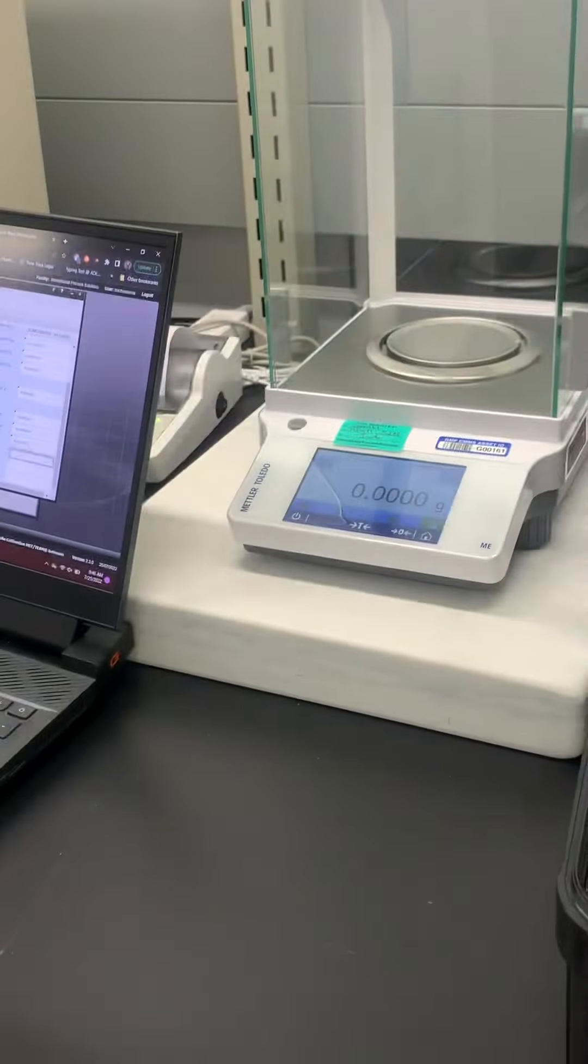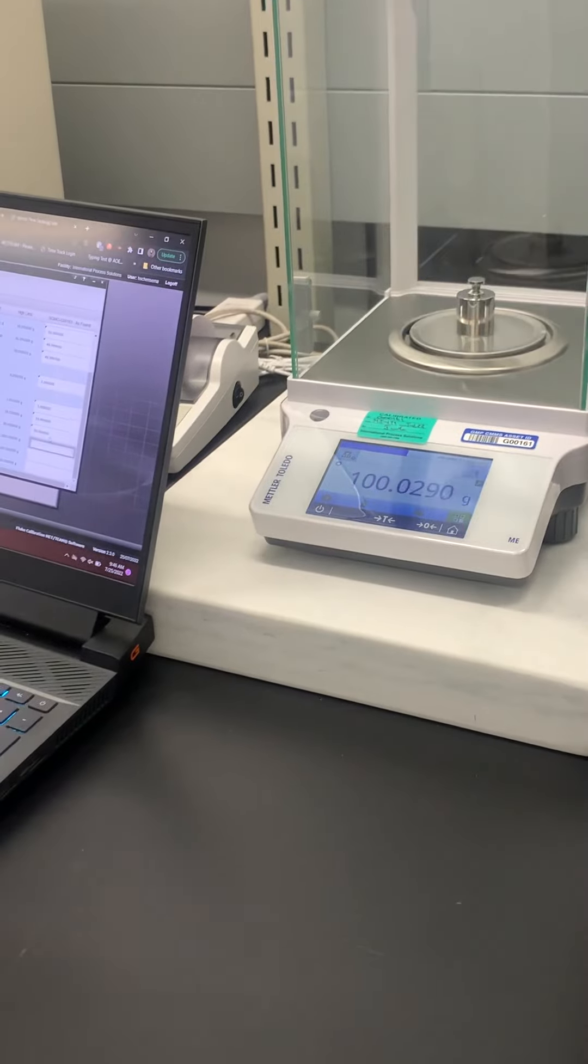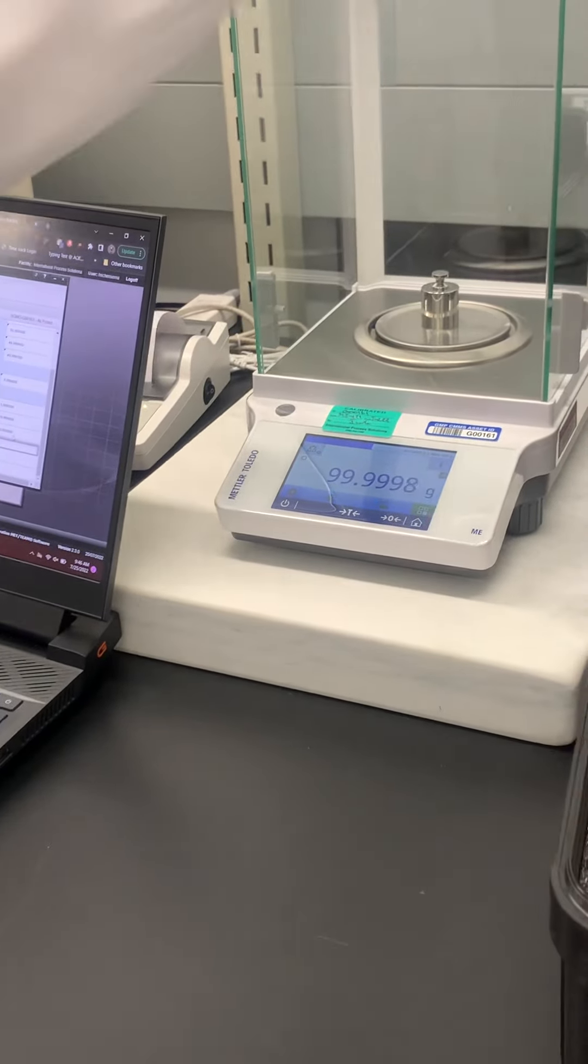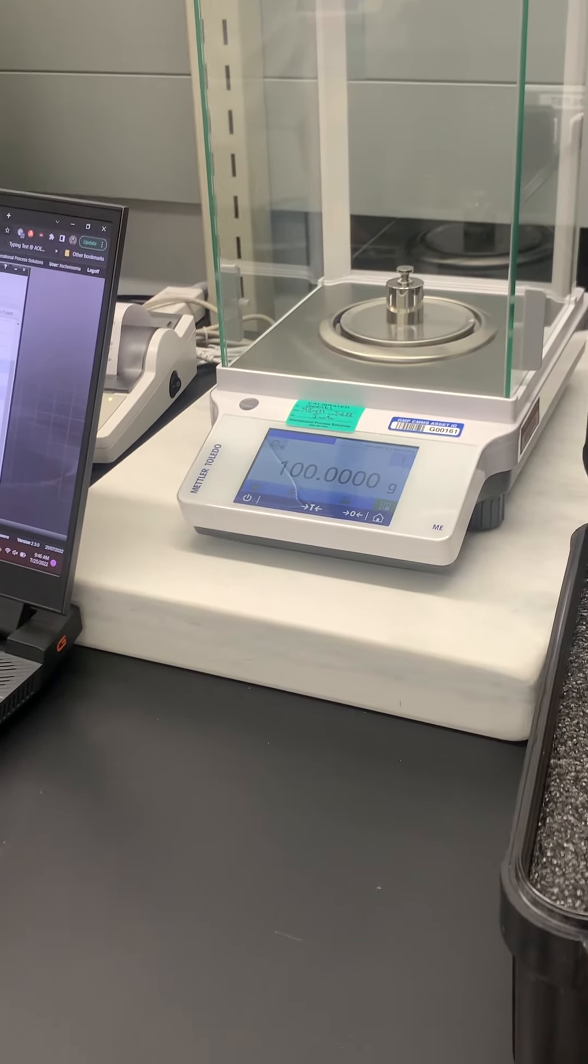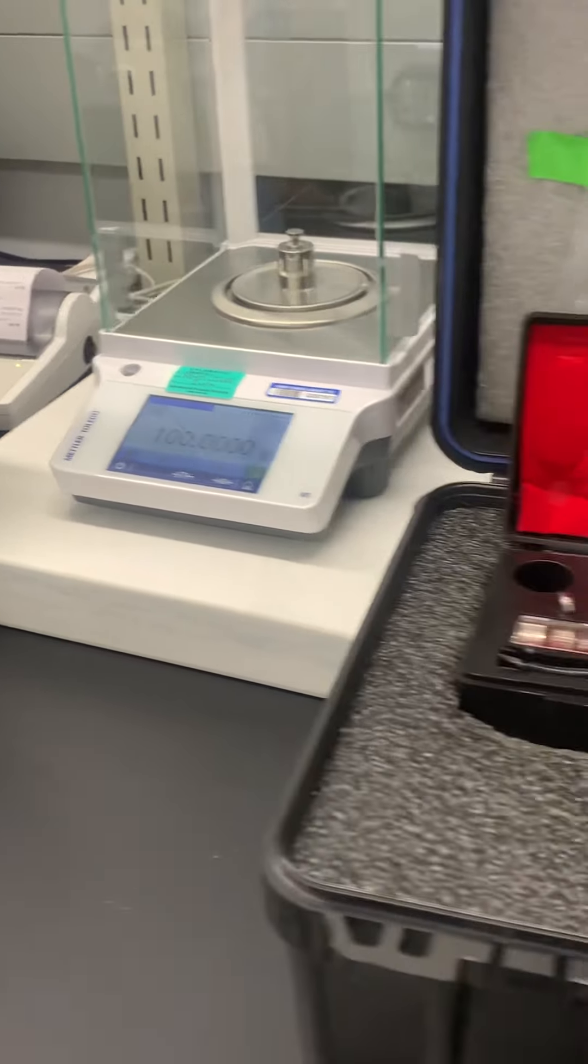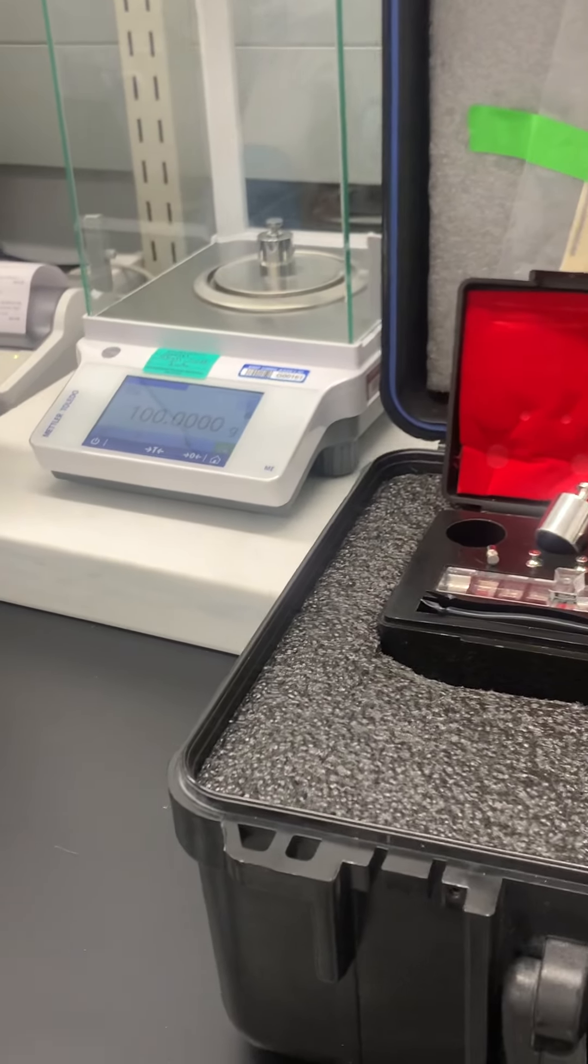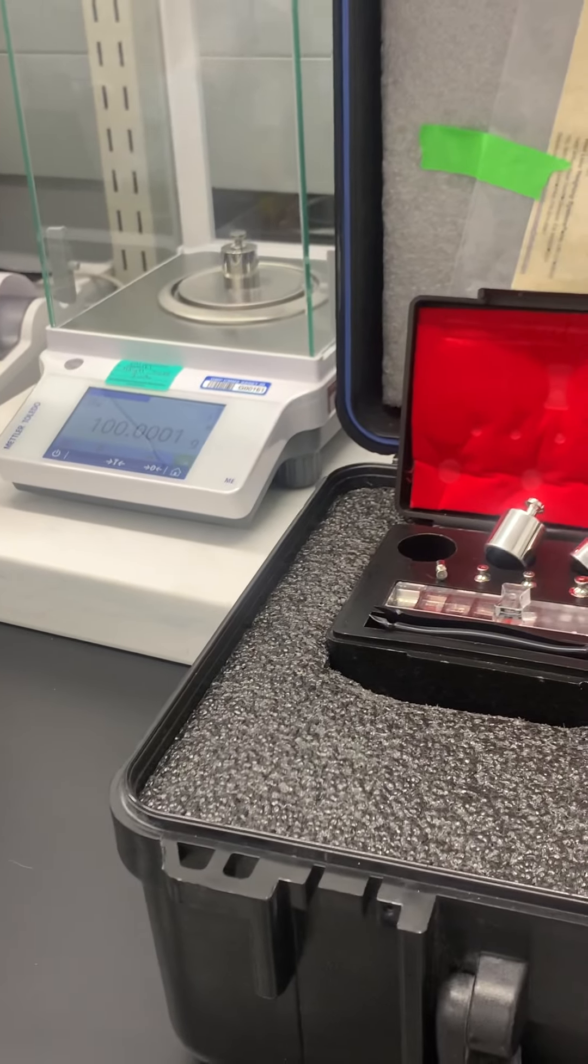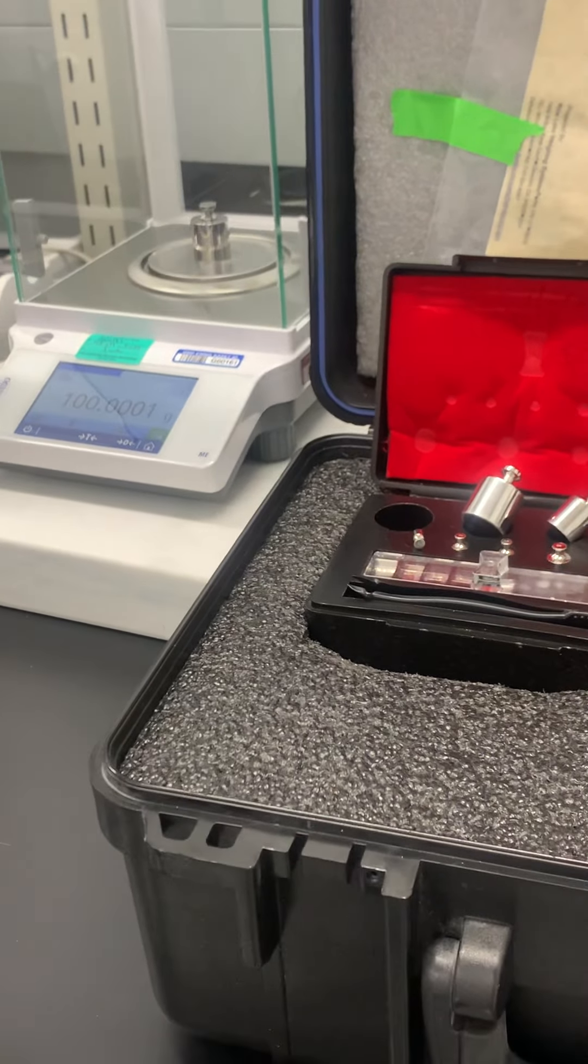Analytical balances in one day, and it's a little time consuming. Yeah, they had a client site who would get only analytical balances and scales done. That's all I did for three days. Really? Well yeah, now I'm a professional.